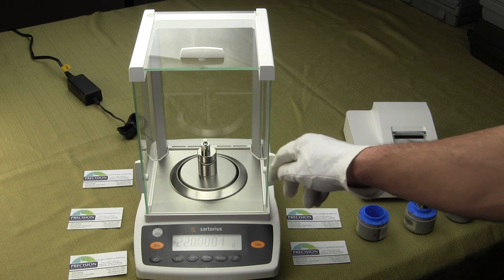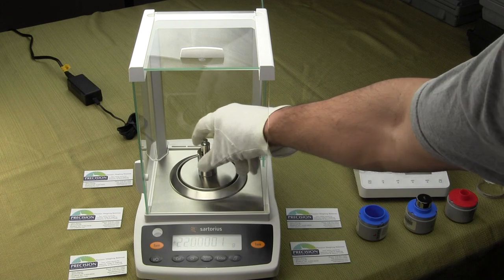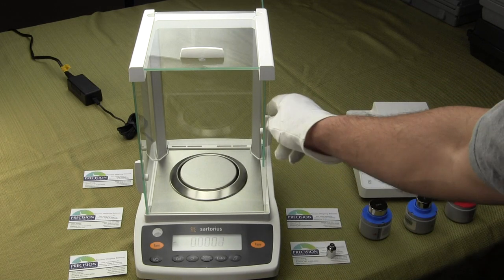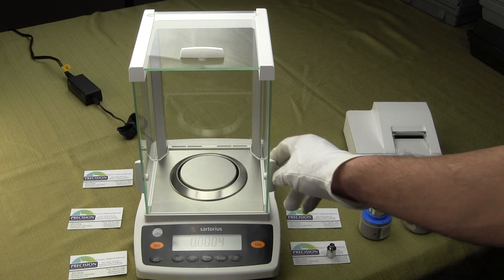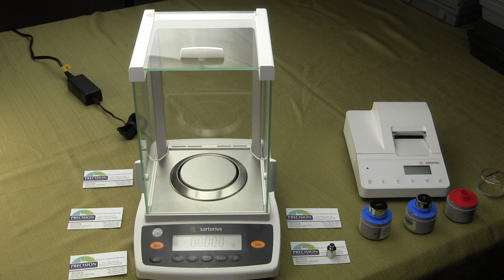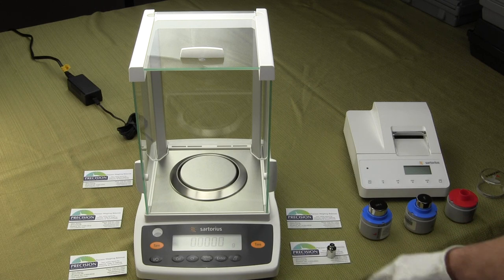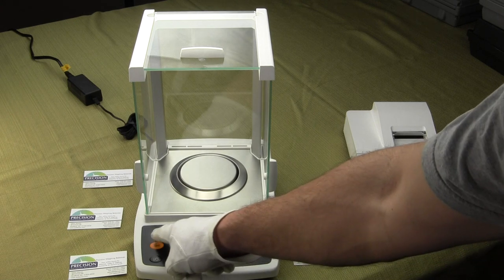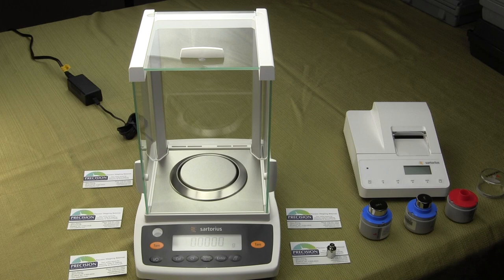Calibration of the balance is very simple. All the Entris series are external calibration only. To perform calibration, first you want to level your balance. On this particular model, you have two adjustable feet in the front and a spirit bubble indicator in the upper left-hand corner.